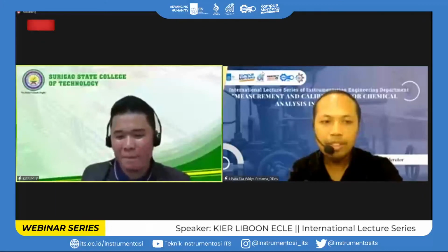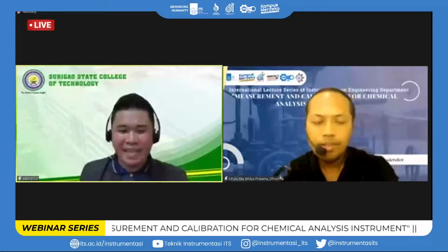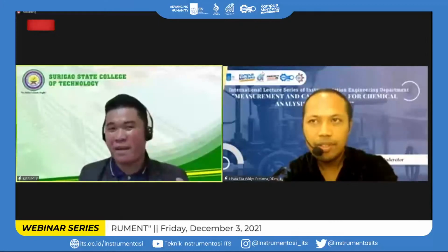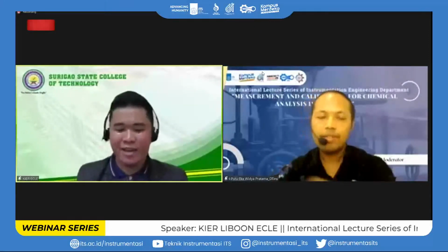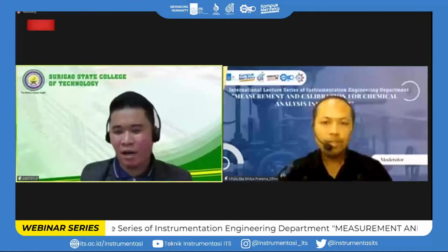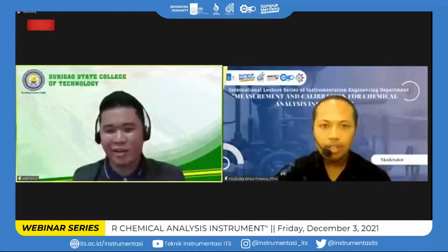So for example, if the absorbance reading does not meet the standard absorbance reading set by the company, there is a mistake during the conduct. For example, if the food product is coffee, and the absorbance reading is not similar to the standard set by the company, there might be errors, or the concentration is being increased.